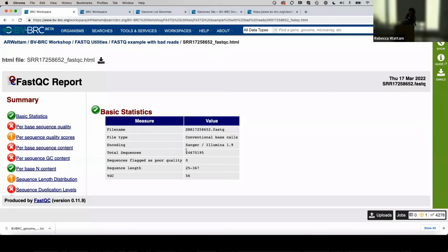With this particular sample, I also ran it in taxonomic classification, and I could see it had a strong SARS component. So you could pull that out. Although we're not going to work on that for this next section, right now we're going to show you how to do an alignment and align your reads to it.